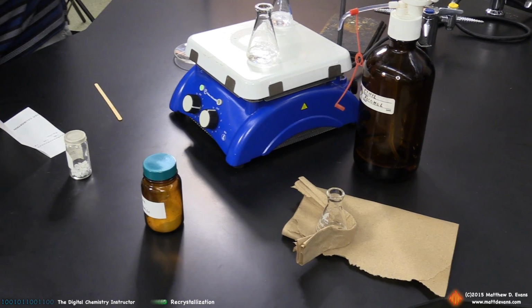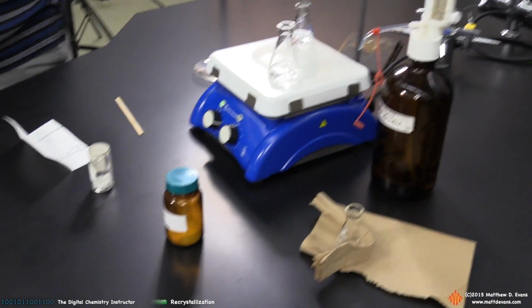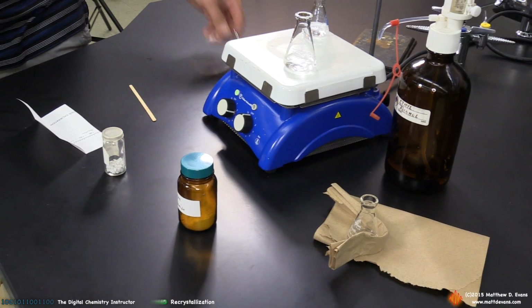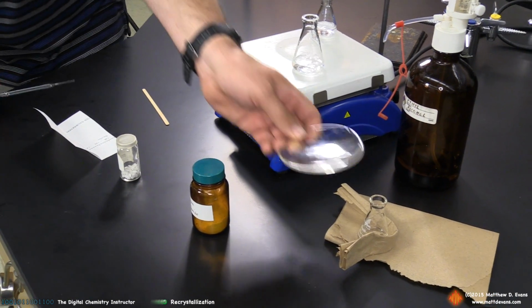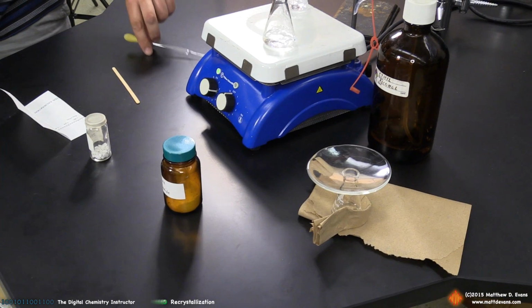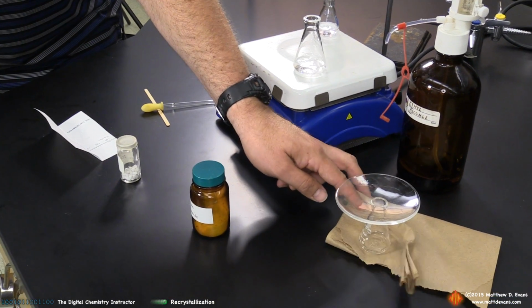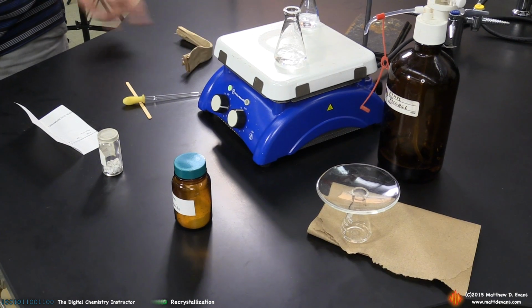Now, I'm going to find a watch glass to put on top of the flask. Oh, it's right next to me. I didn't see it initially. And so just cover that up, prevent dust particles and other things from getting in there while it cools. You want this to cool as slowly as possible. That's why I have it on a paper towel like so.